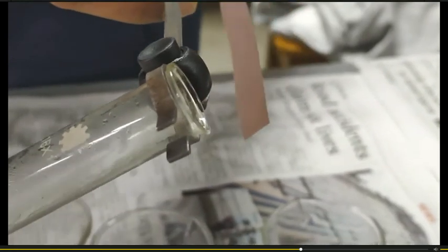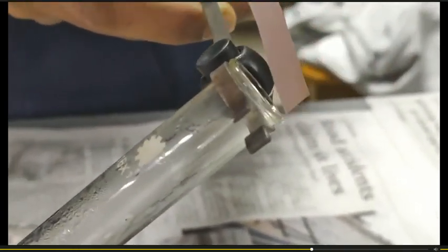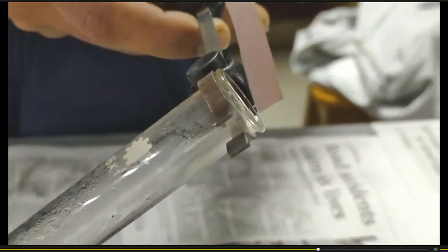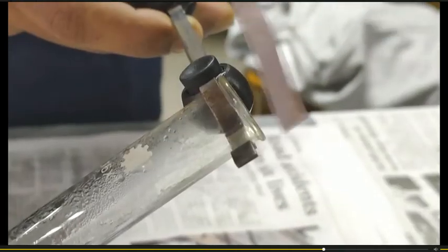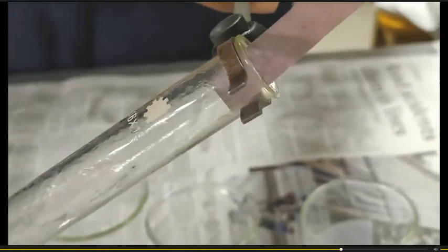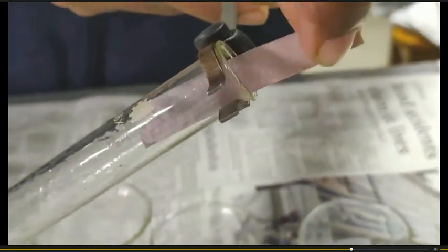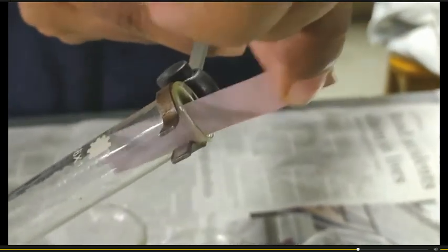The red litmus paper will become blue. And the red litmus paper has become blue in color. It is blue.